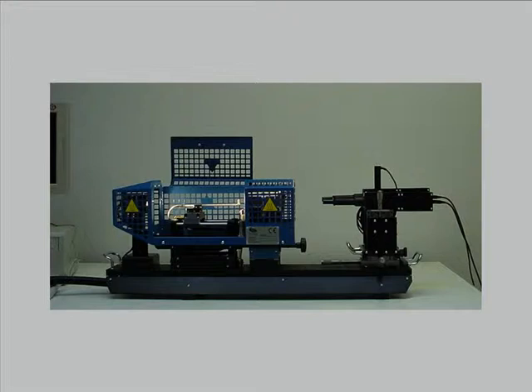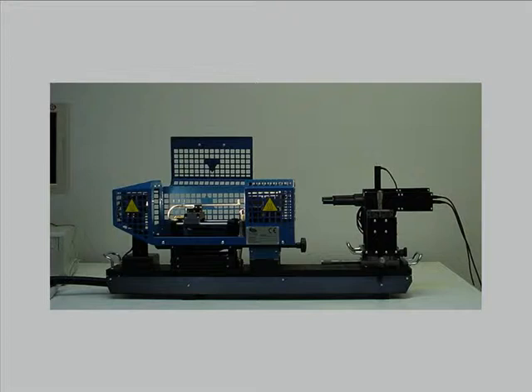The optical dilatometer MISURA-HT is the only instrument available on the market which is able to follow the process of expansion, sintering, or bloating with high resolution and making no contact with the sample.